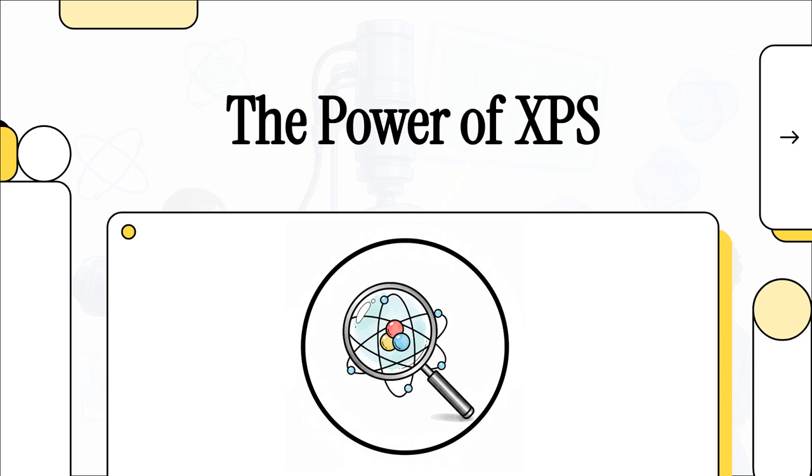Now, I want you to imagine for just a second that you're a detective. But instead of investigating a normal macroscopic crime scene, you're tasked with uncovering a really high-stakes mystery, right at the absolute limits of physical reality. You need to know exactly what elements are hanging out on the very surface of a material, and you need to know exactly how those atoms are chemically bonded to one another. Well, today, we're exploring the ultimate tool for that kind of microscopic detective work.